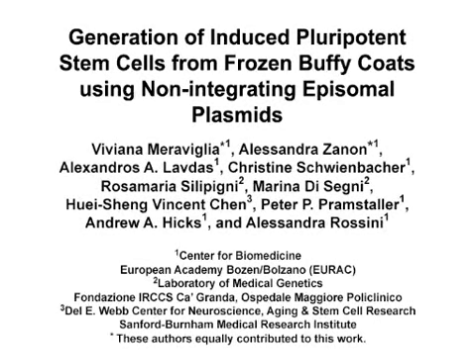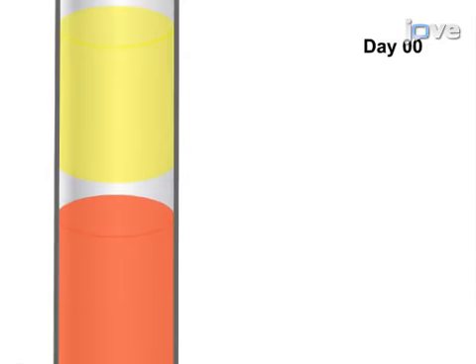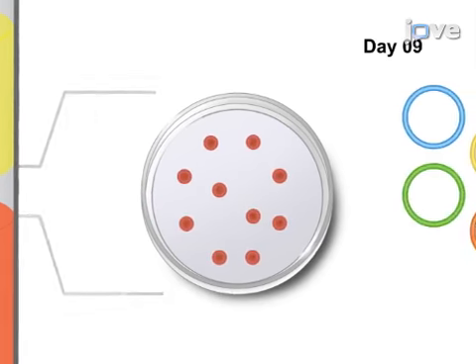The overall goal of this procedure is to generate induced pluripotent stem cells from human peripheral blood mononuclear cells obtained from frozen Buffy coats using a cost-effective and virus-free protocol. This is accomplished first by the isolation of PBMNCs from Buffy coats after whole blood centrifugation without a density gradient, followed by expansion in a specific blood culture medium.